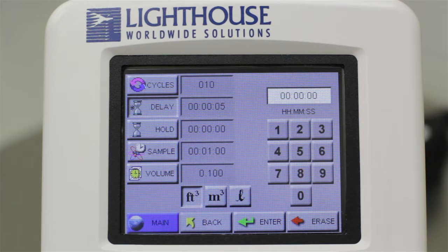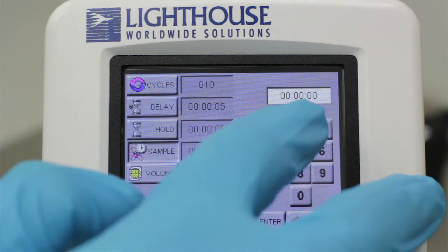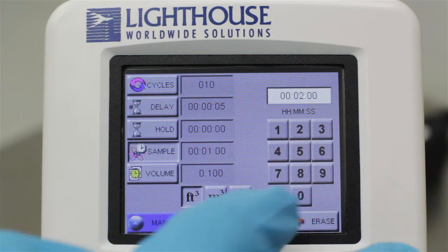The Hold button will set a separate time value that determines how long the particle counter waits between cycles when running multiple cycles. The Sample button will set a duration for each particle sample. Once you set a sample time value, the volume value below it will change — these two values are linked, and changing one will affect the other.